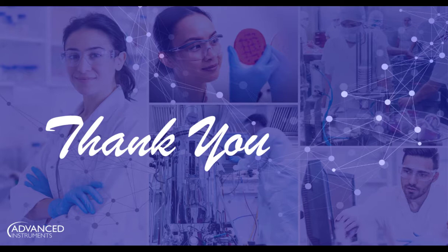Maybe also, Kristeena, you could comment on this. Sure. I totally agree. And I would say, of course, it's going to depend on what cells you're working with. Most of our customers, if they're working with CHO cells, are typically reporting something around the 290 to 300 milliosmol per kilogram of water range. However, we have definitely, like you said, Dr. Jungbauer, seen a range, and it depends on the cell line. It depends on what your goals are from your cell culture. So we're happy to work through that with you. If it's something that you're interested in, please feel free to contact us.